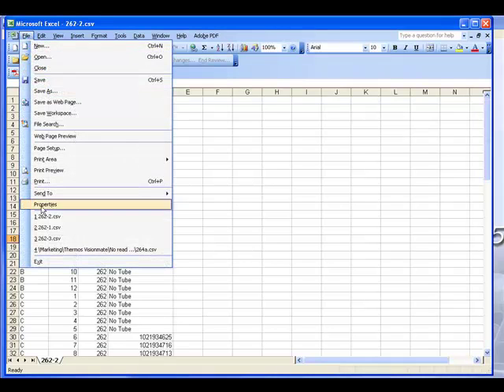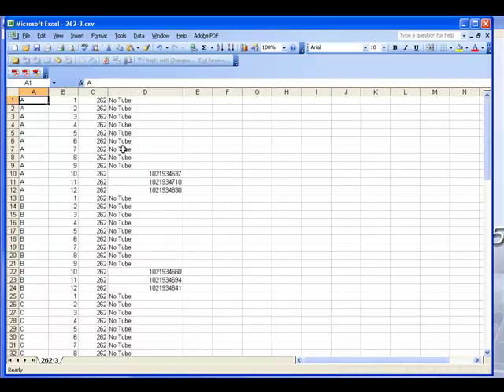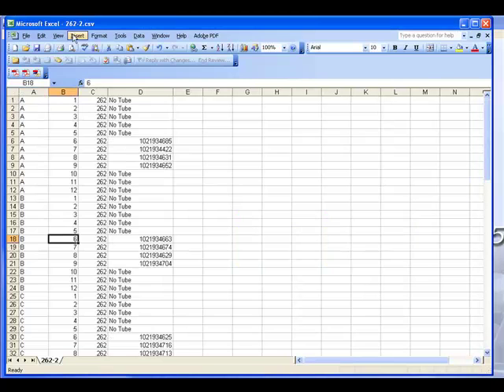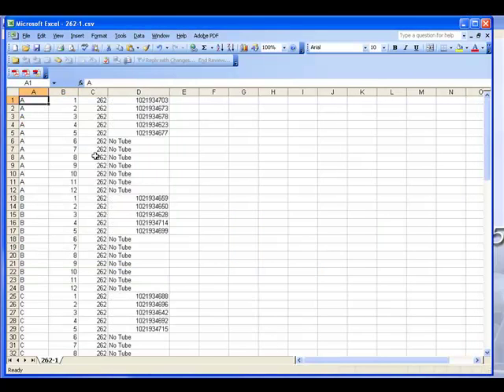And then I open the third one, and you'll see that 10, 11, 12, 10, 11, 12 is filled. So I've done a little modification of 3 files that were sent to me. Also, I made sure that the box is the same in all 3. They're all going to box 262.